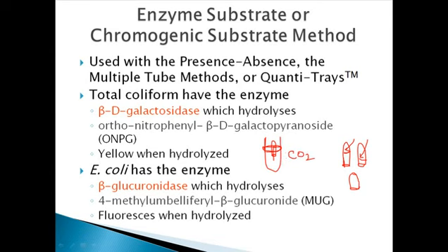It actually helps us to determine whether we have coliforms or not, but it does not help us to determine whether we have a fecal coliform or enteric bacteria genera. So after knowing this, we can have other chemical steps which are going to tell us the presence of total coliform or fecal coliforms. They are chemical tests. So these are the first normal steps, or presumptive tests, that easily tell us whether we have coliform or not using this carbon dioxide production test.